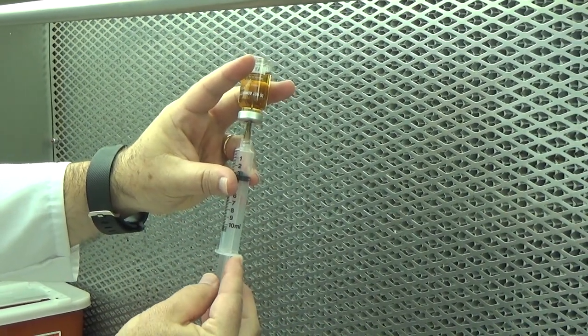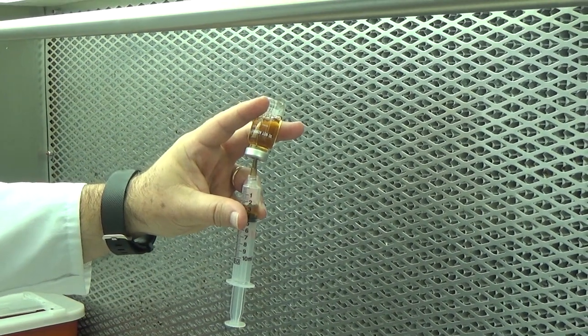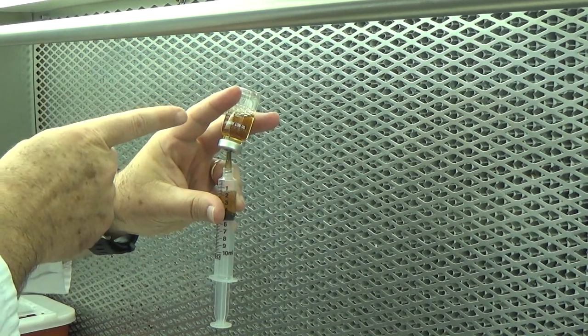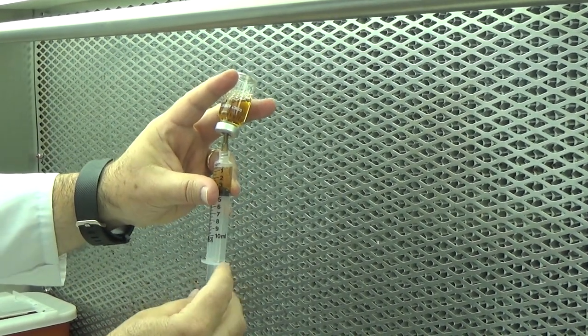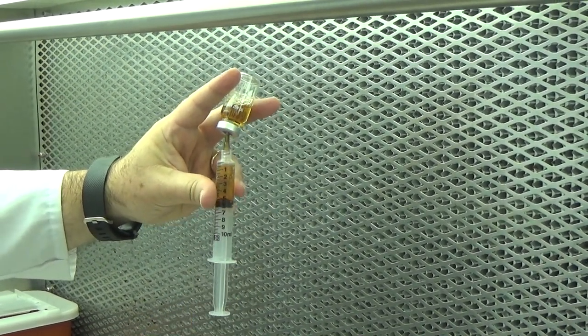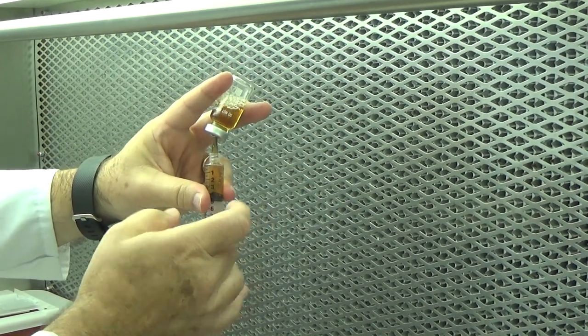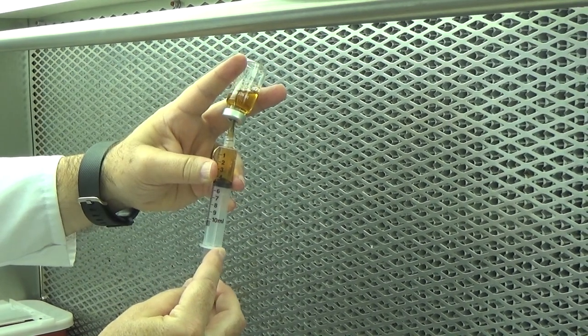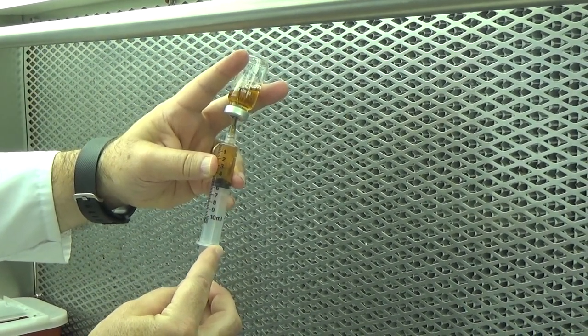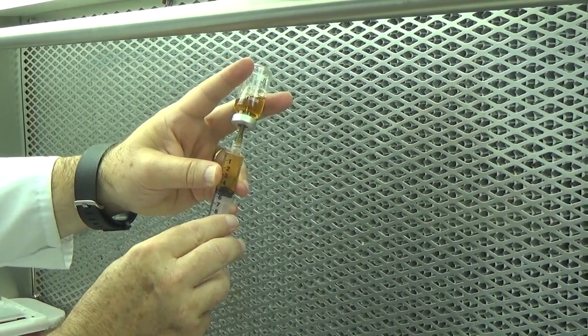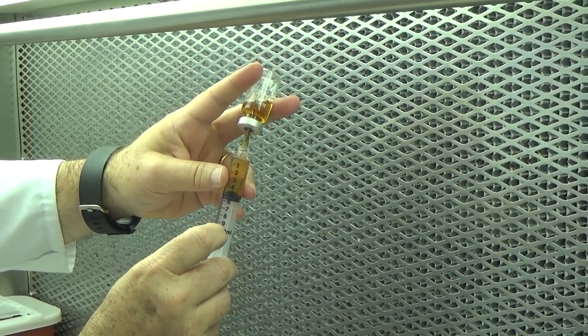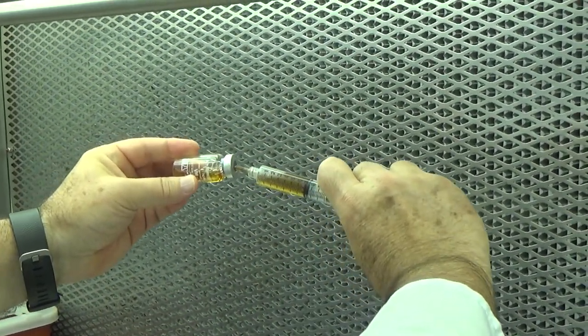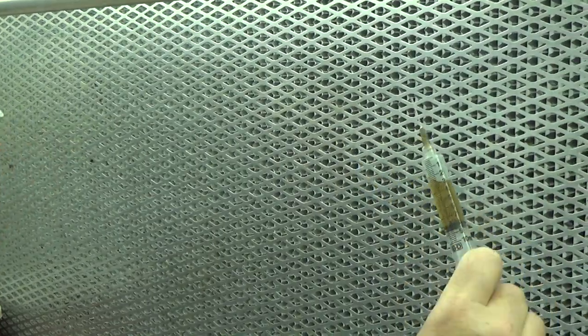And then I rotate the vial in such a manner to keep the critical site in first air. At this point, I will pull on the plunger and release. This allows me to keep a low pressure inside the vial. And once I've gotten rid of all the replacement air, I simply draw back to my desired volume.